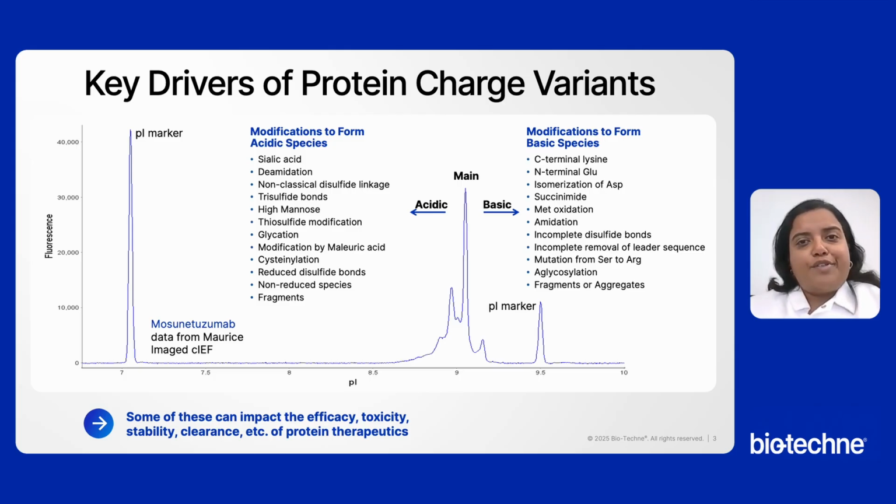It is well understood that the modifications from chemical or enzymatic reactions during the production and storage processes of the protein therapeutics lead to form the charge isoforms. The charge variance is a critical quality attribute in biotherapeutics requiring thorough analysis to ensure product integrity.